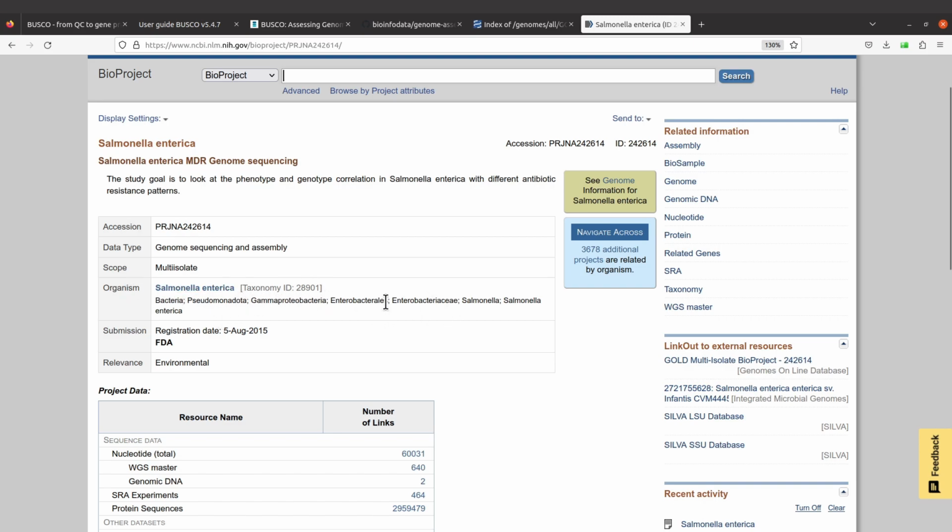So let's just take a look at all of them here. So we have bacteria, this is up to this. Ideally, we want to go for the lowest one, I mean, the one which is available. If you take a look at the list, which we'll look at very soon, you need to go for the lowest one. That becomes more specific ideally, but if you're not sure, you can still go for a higher name here.